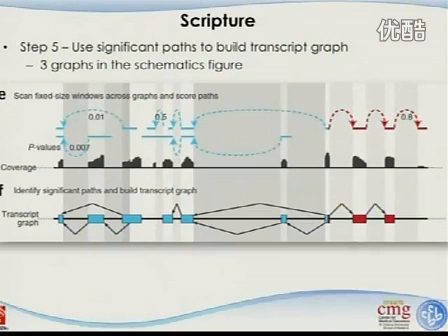a real one. For this one, it's 0.5. It will not be in the next stage of connection. So you can see that those are the ones, and this is 0.8. It has been ruled out, so they'll just be considered as noise.